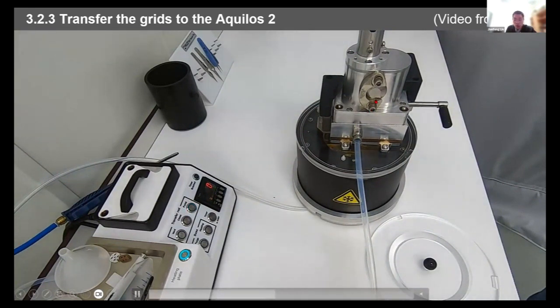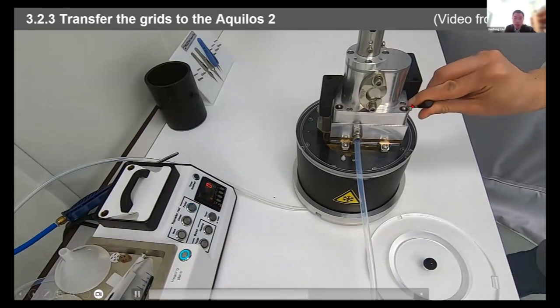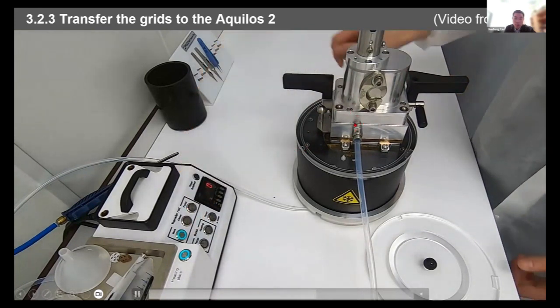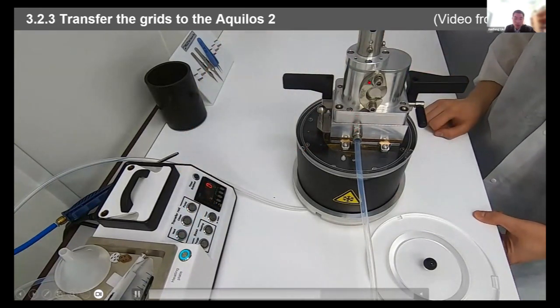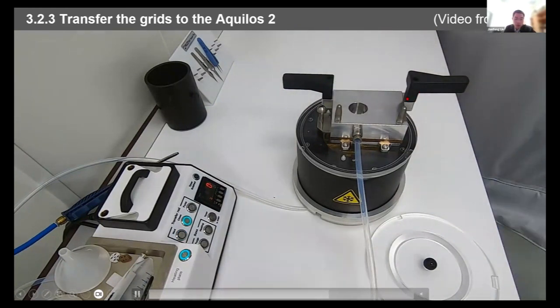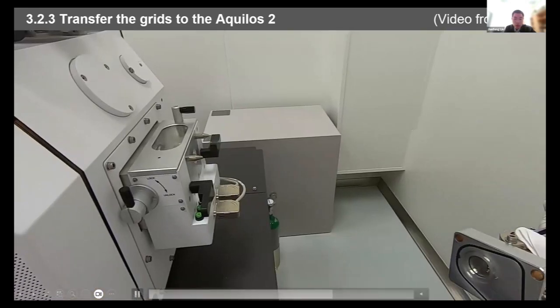This process will provide a vacuum, which is good to maintain the sample inside the chamber to be cold and clean. When the pumping is ready, close the top part of the valve, and then vent the bottom part. After venting, the top part can be easily taken out and transferred into the Aquilos 2 machine.